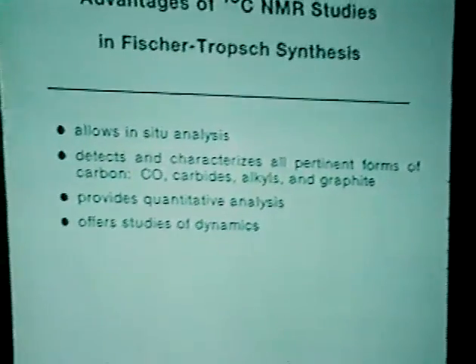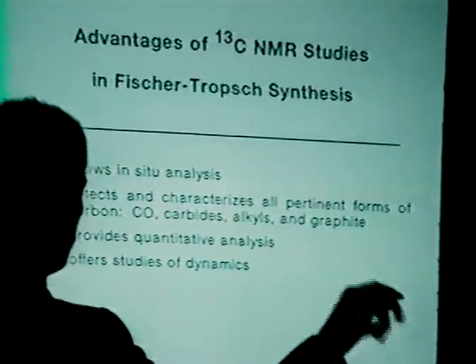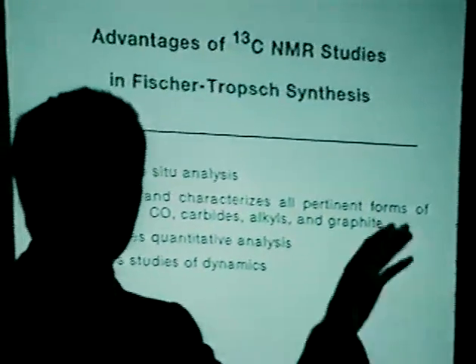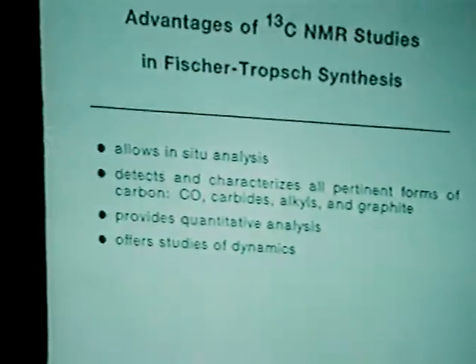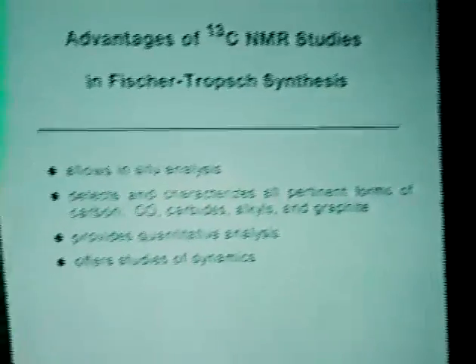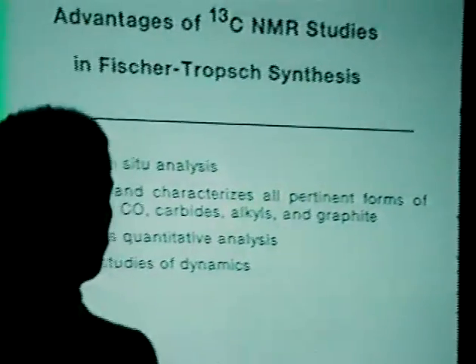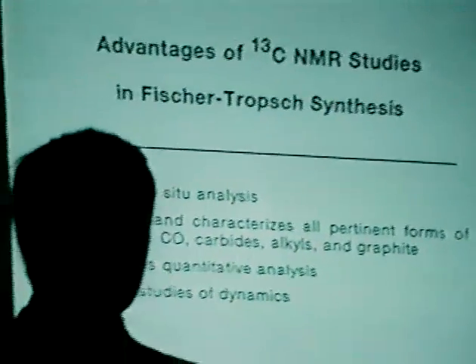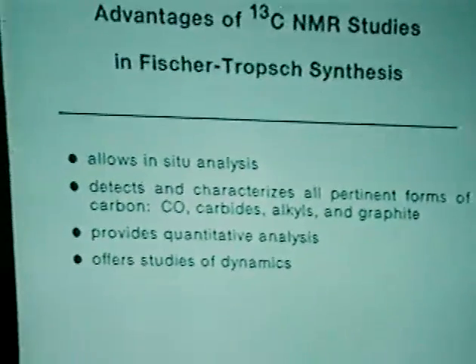The things that we're talking about today are static systems as opposed to online reactors, mainly because for the initial studies, we didn't want to put the money into having a carbon-13 CO flowing through as we did the long-term characterization. The NMR can detect all the species pertinent to Fischer-Tropsch reactions, as opposed to other techniques which have different extinction coefficients or detectability of these things.